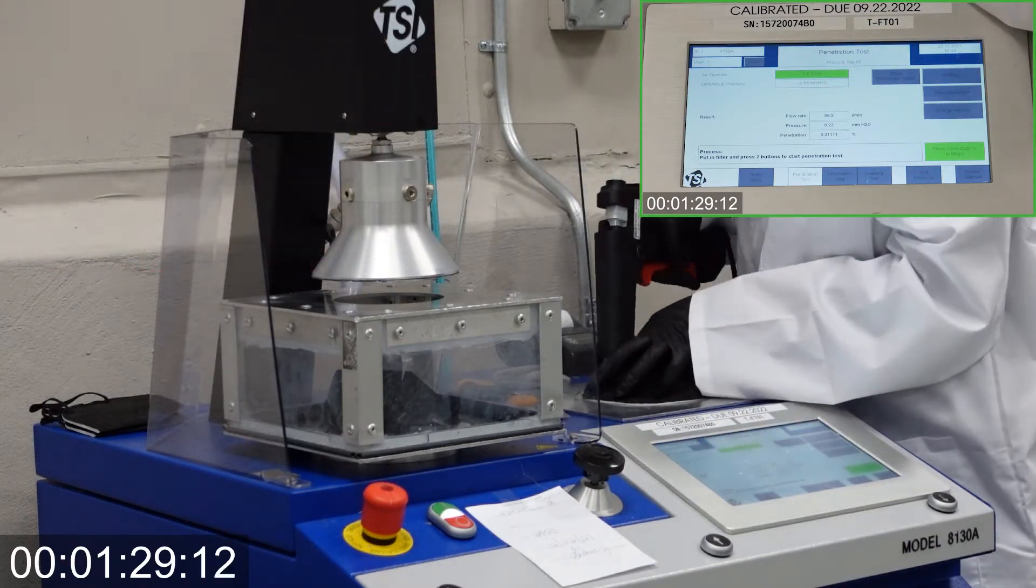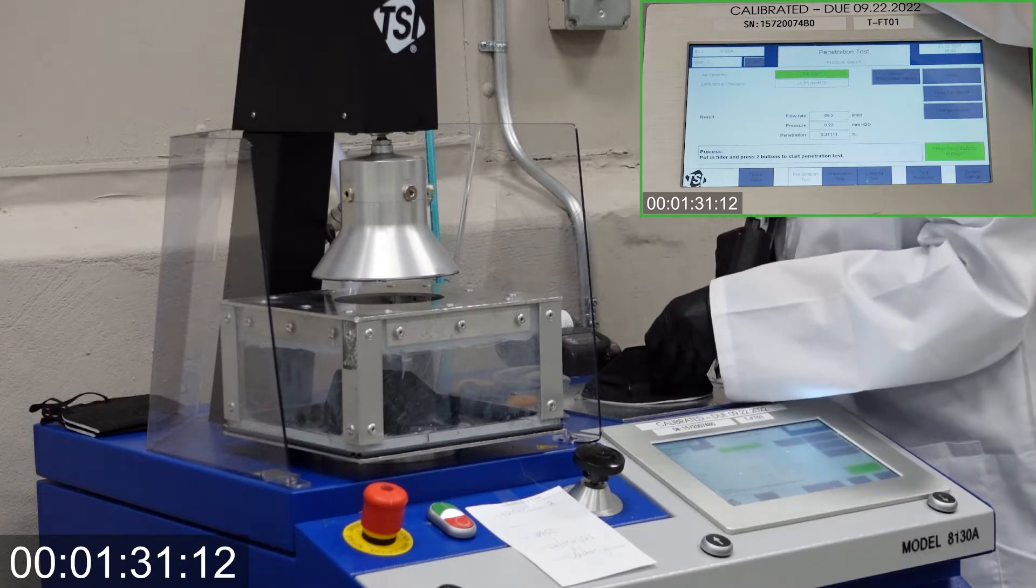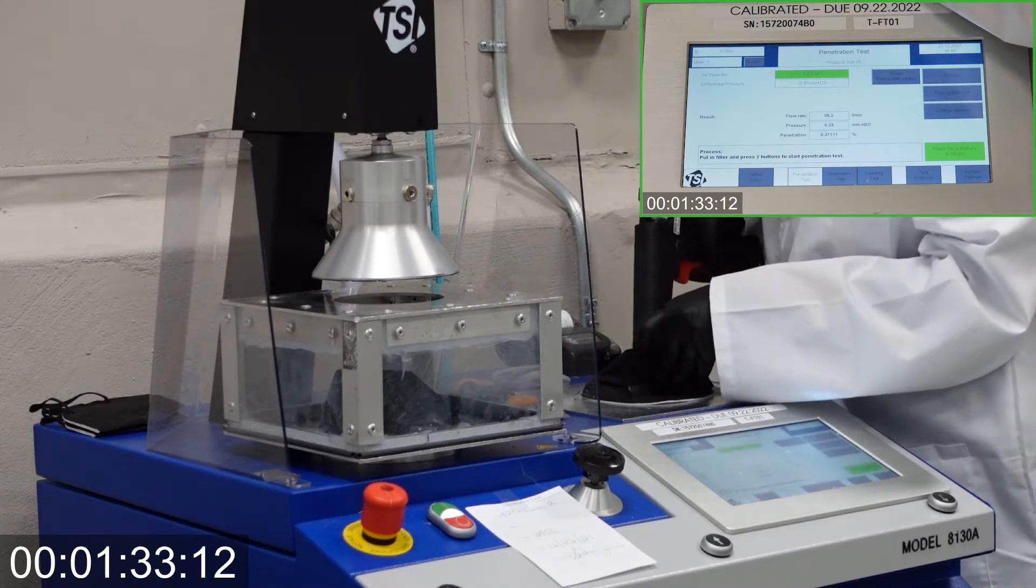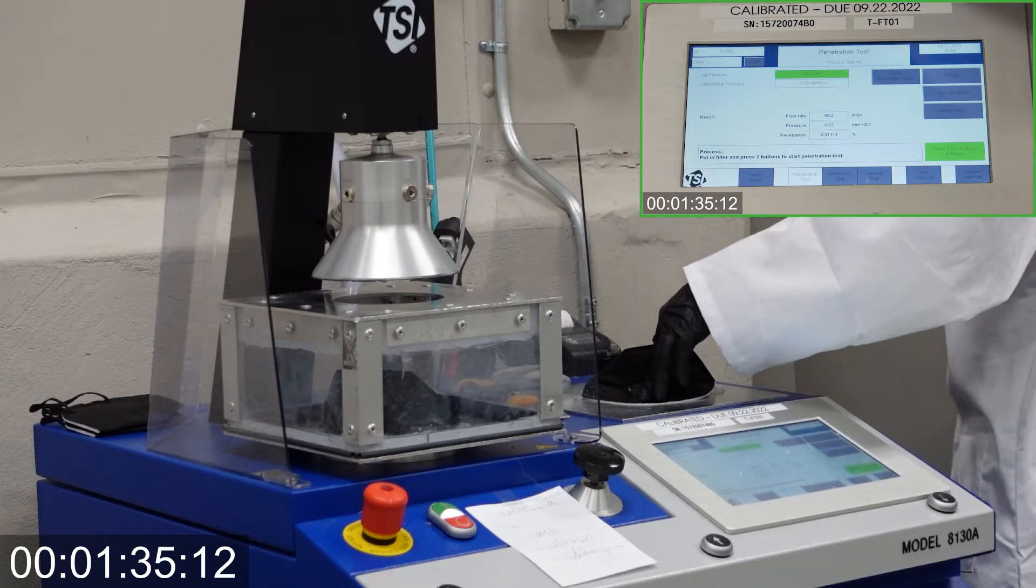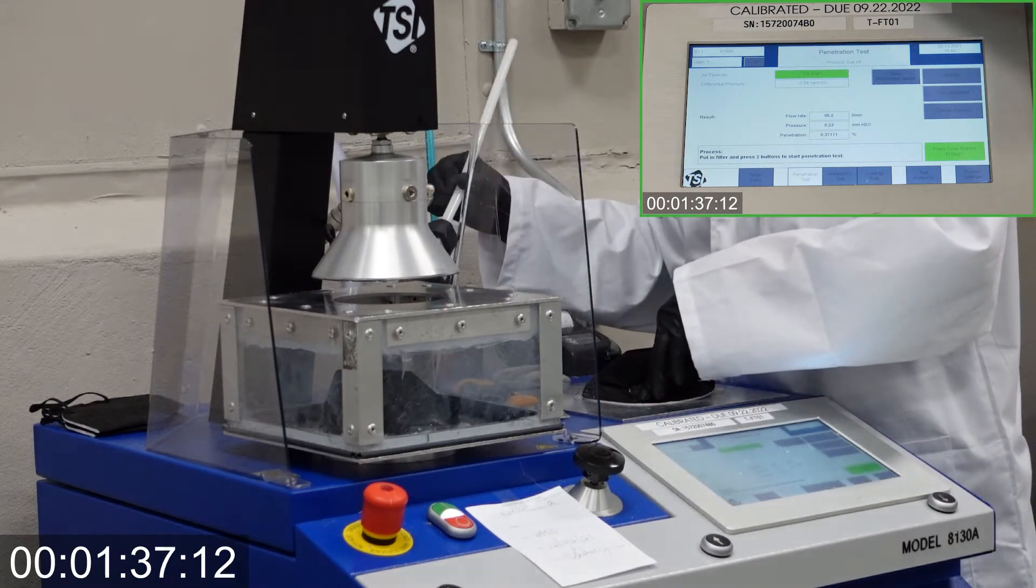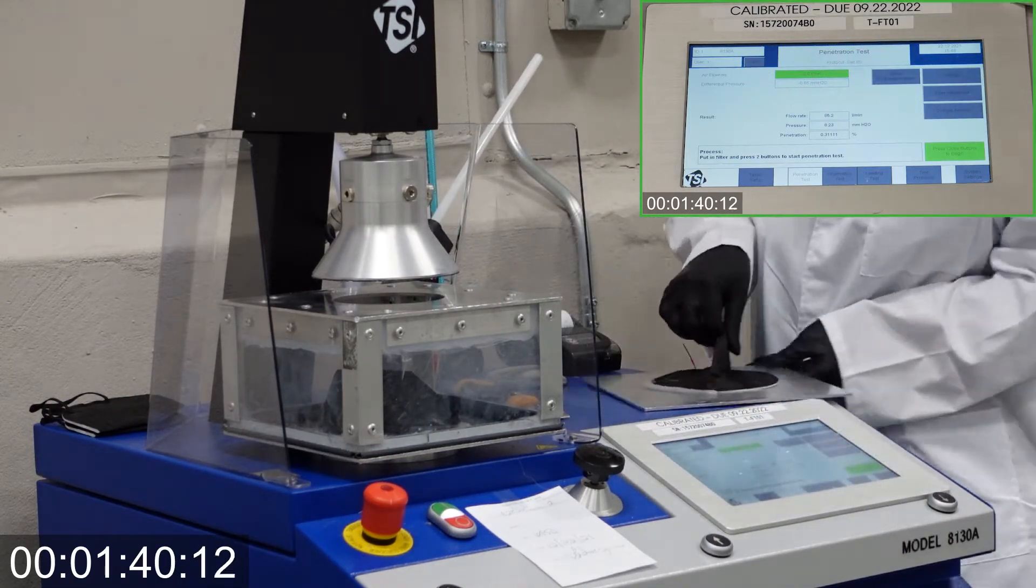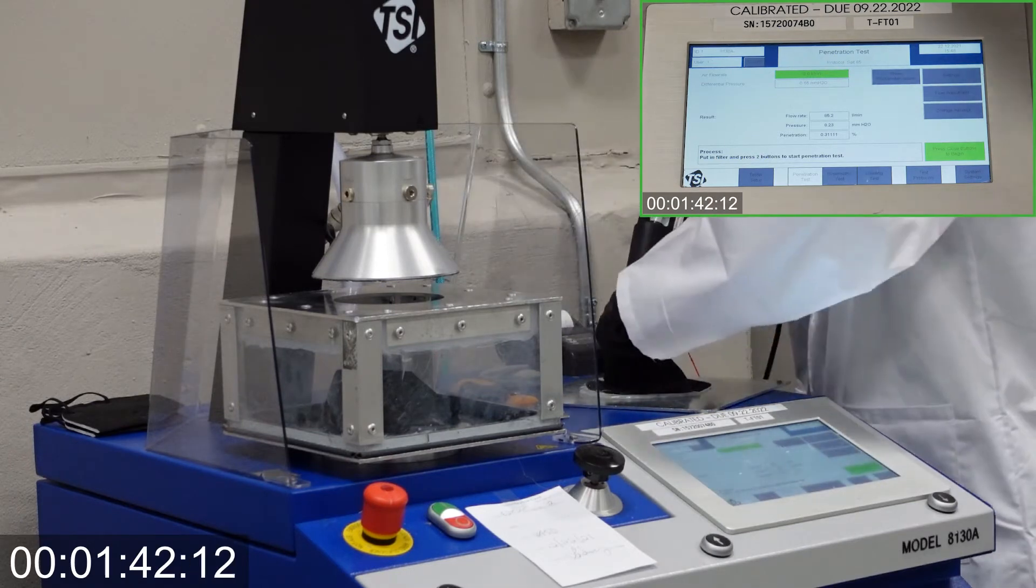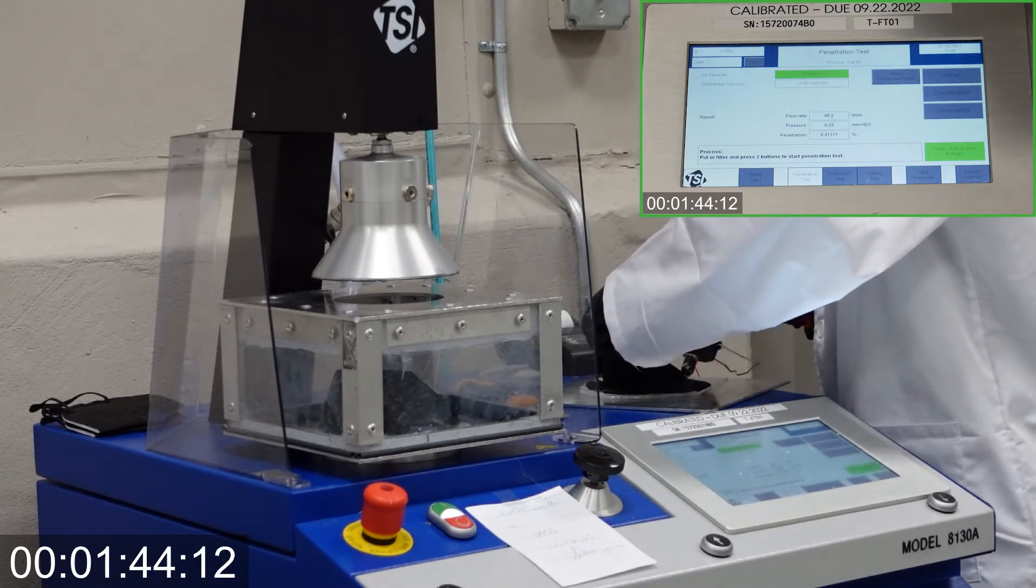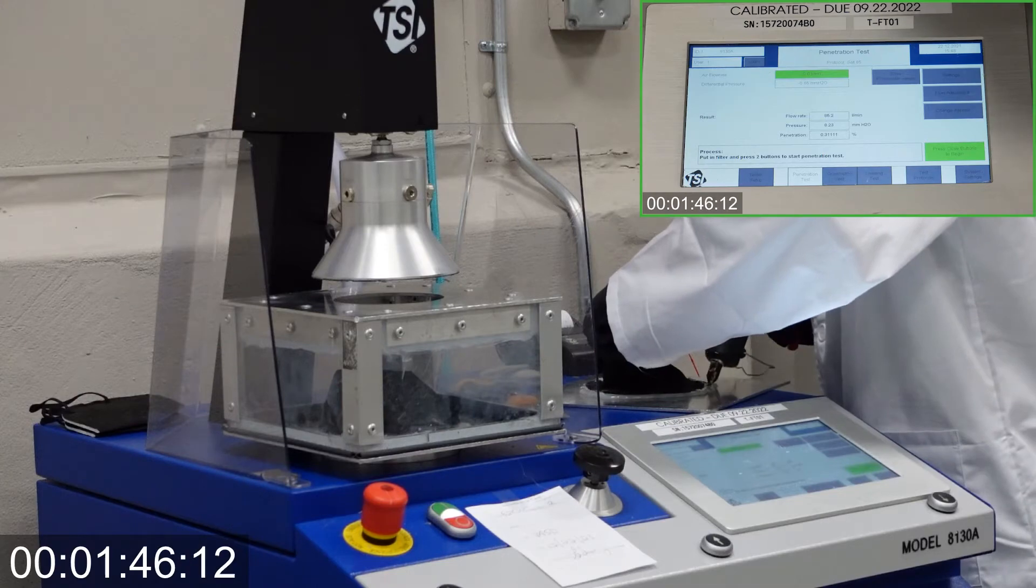Additionally, we conduct testing on a regular basis by using TSI green line papers to make sure the TSI 8130A filter tester is giving accurate results. TSI visits our facility annually and conducts field service for the 8130A tester for calibration purposes.